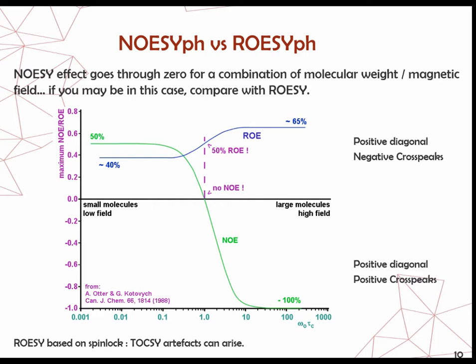So there is no solution to that problem, I guess. Do you really need the carbon spectrum during the day? Sometimes, yes. So if you need it, you have to make very concentrated tubes, and so usually the proton spectrum is not so good.